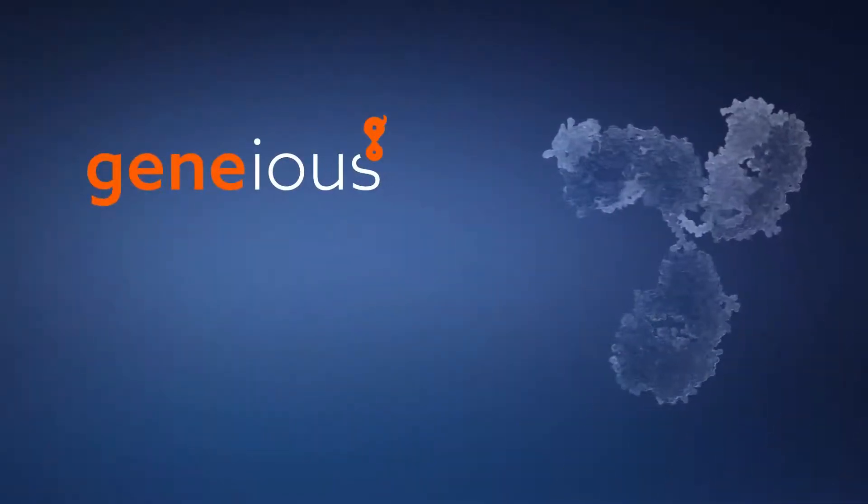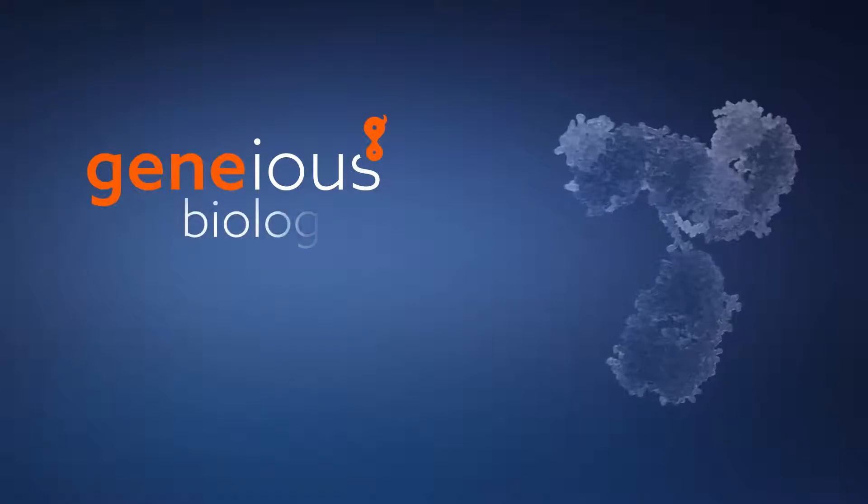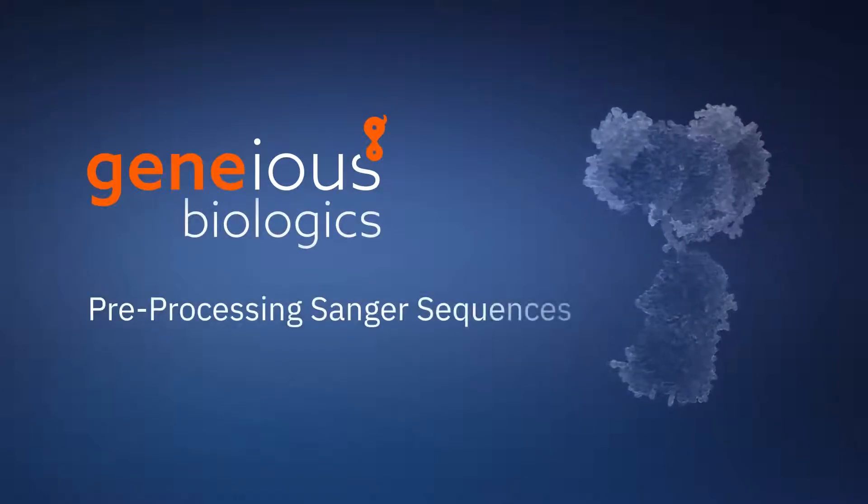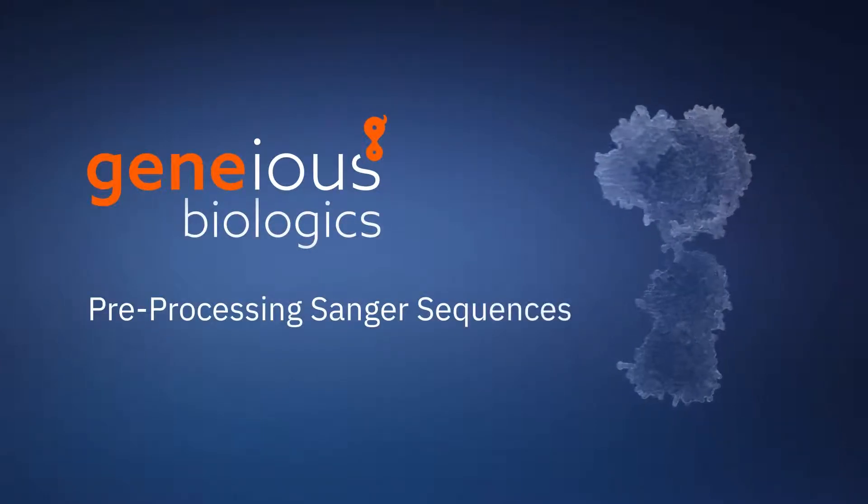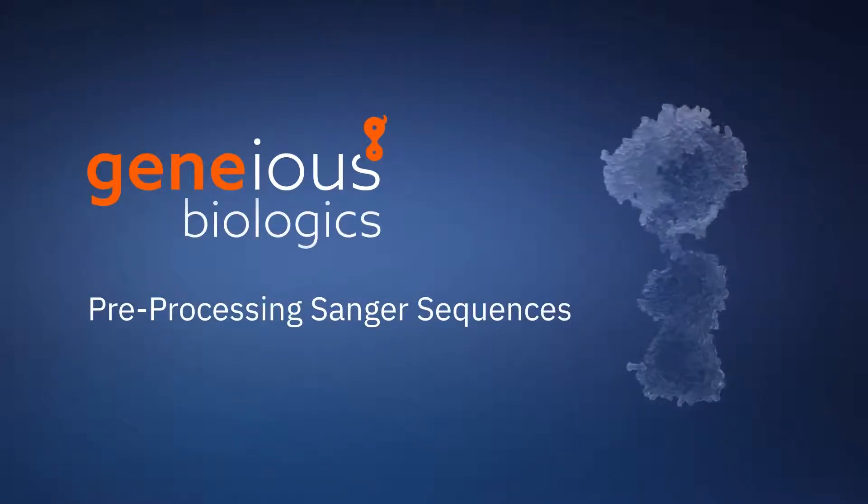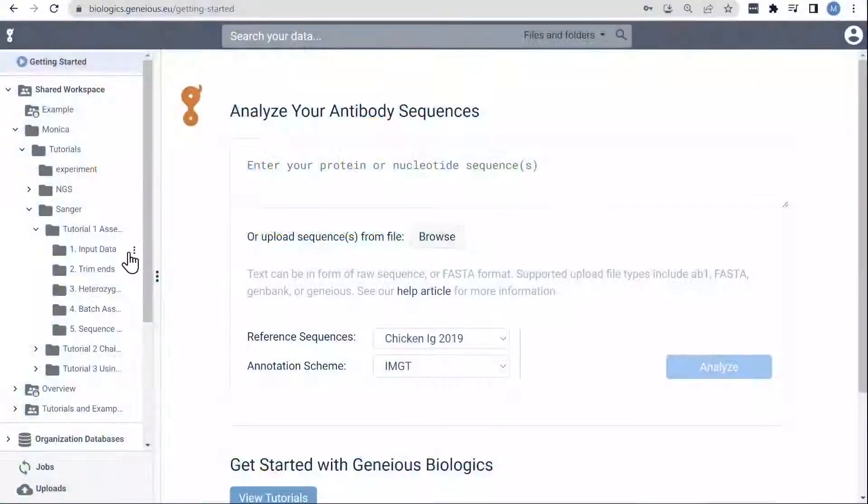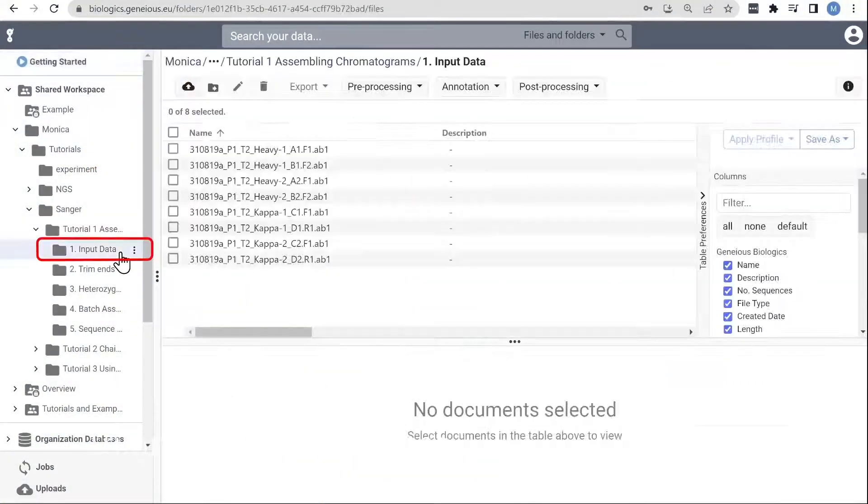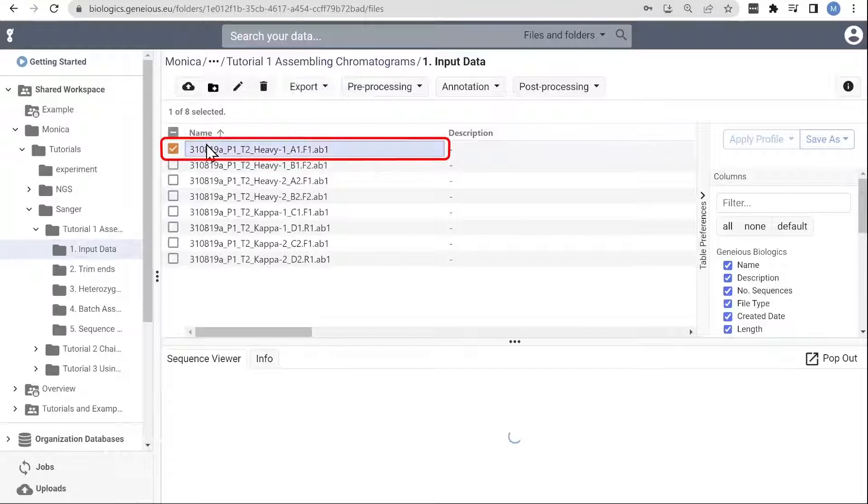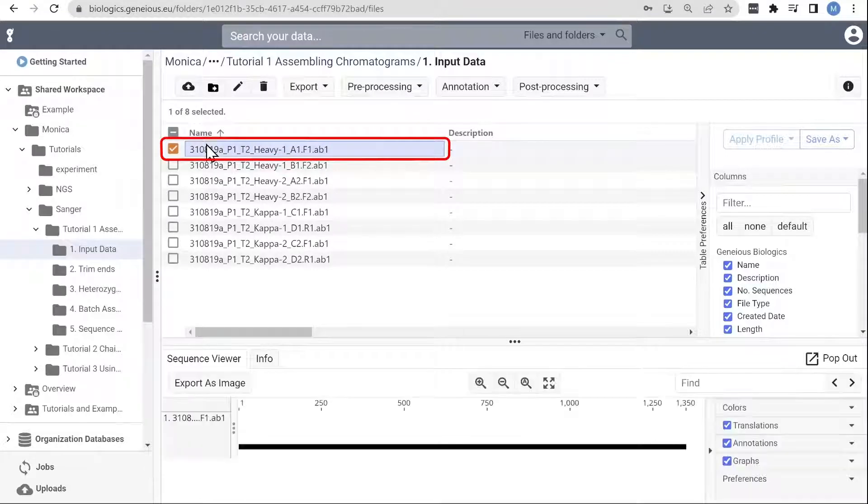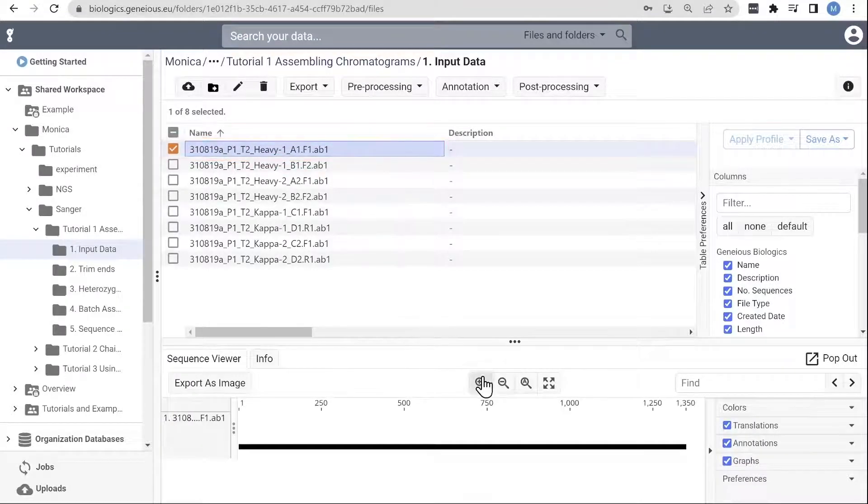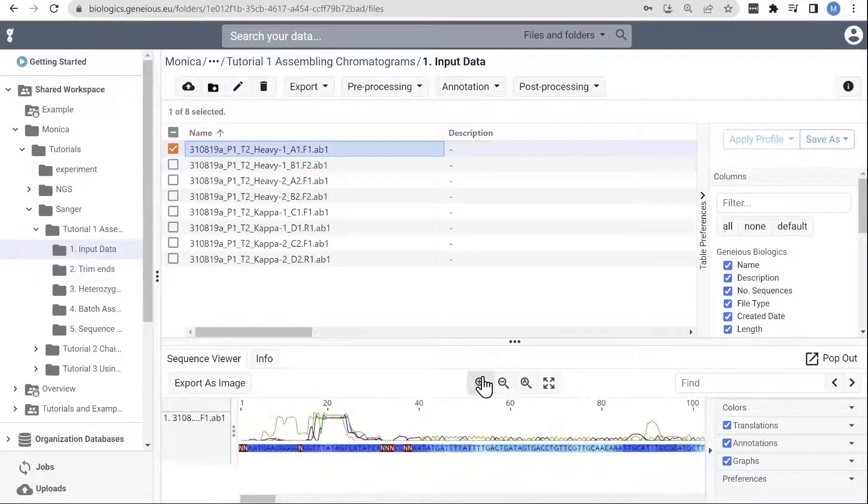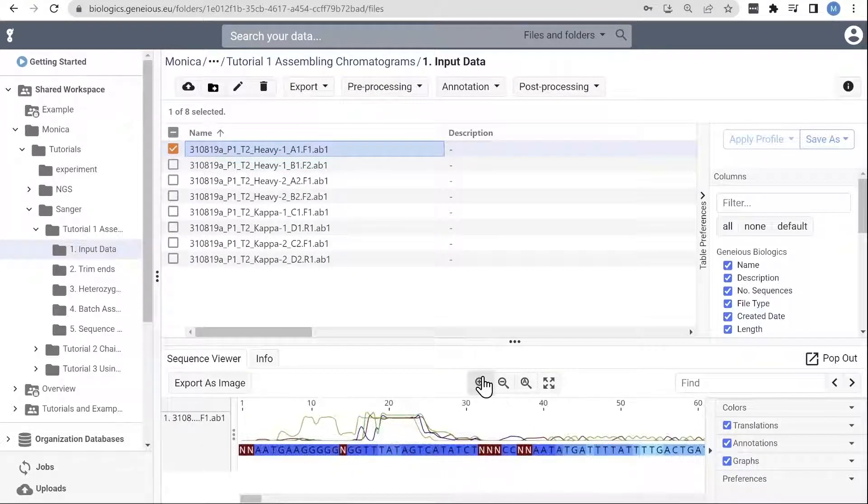Welcome to this Genius Biologics tutorial video on how to pre-process your Sanger antibody sequences and prep them for analysis. To start, let's look at our raw Sanger sequences. For this example, we'll be working with the forward and reverse reads from two heavy chains and two light chains.